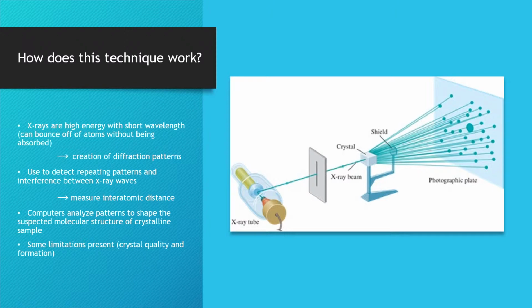It's worth noting that until the last decade, X-ray film was used in imaging these diffraction patterns. In more recent years, advanced imaging plates and software that can connect directly to machines for data analysis are being used. From these diffraction patterns, scientists are able to detect interference between X-ray waves, symmetry in the packing of the crystal structure, and the size of the repeating units of the lattice as the waves scatter on the atoms.